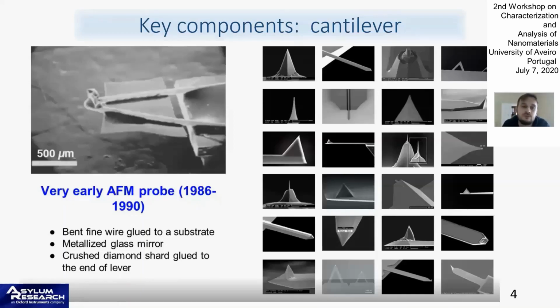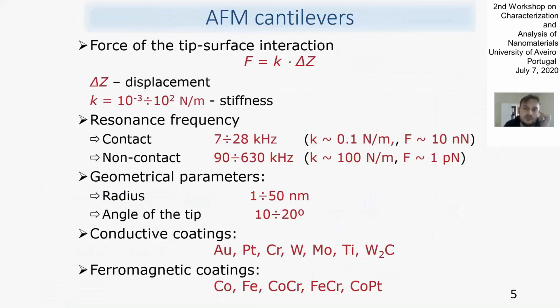If you need to measure some specific quantities, you may create your own tips. But since then it has become easier to operate with AFM because we can buy tips. They're not too expensive, and for most aims we use normal silicon tips created from silicon by chemical etching.